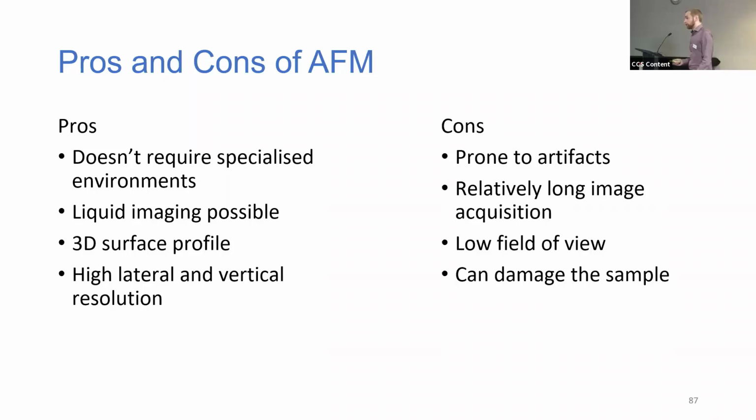Acquisition times for imaging are in the ballpark of several minutes at a minimum. This is a particularly big problem for us because in force curves mode, this takes even longer because it takes pixel by pixel, whereas something like tapping mode takes line by line.